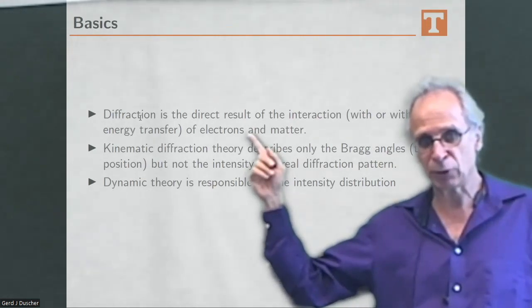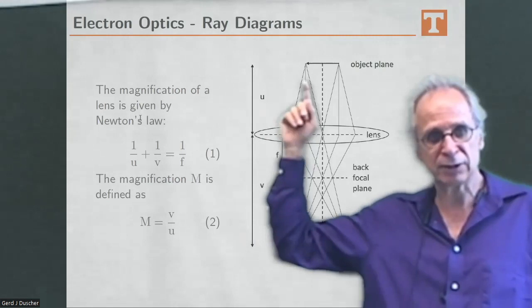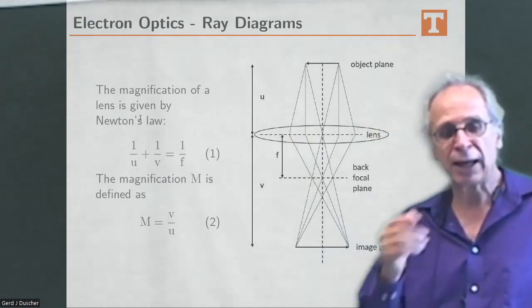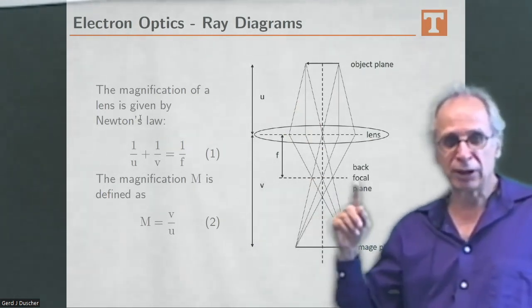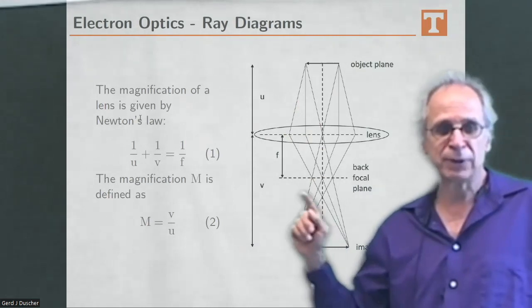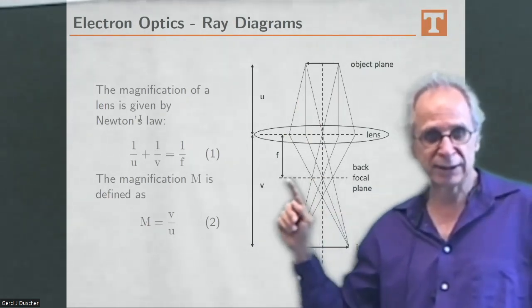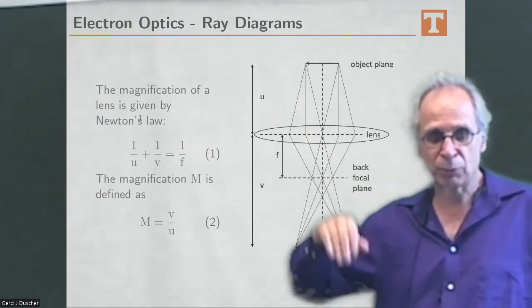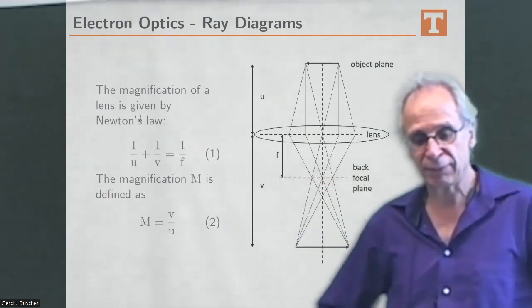After the sample, of course, whatever is coming out of the object, yeah, that's what I wanted to say. So the key thing when you put the sample in the electron microscope is that the back focal plane of the objective lens is at a very specific plane, because that's where we have an objective aperture where we can then select whatever angle we have here.